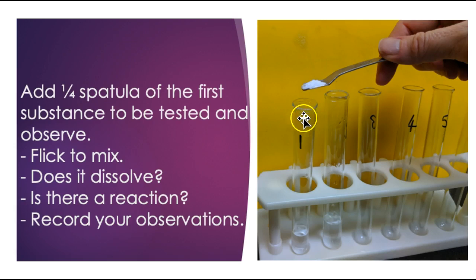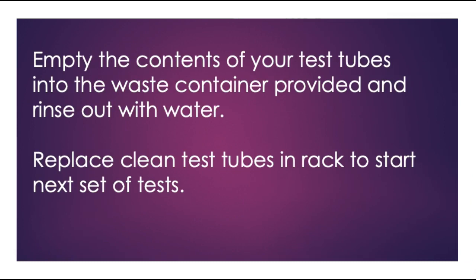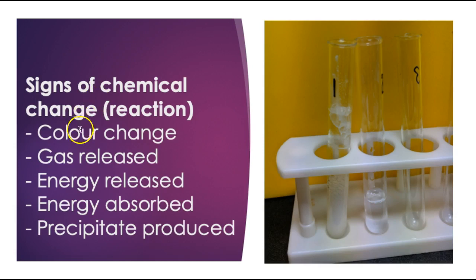So if I drop this one in here, I'll see if it dissolves. I'll try and find if there's any evidence of a chemical reaction. Now I'm just going to remind you what a chemical reaction looks like, the signs. Oops, wrong one, just a minute. There. Color change, permanent.